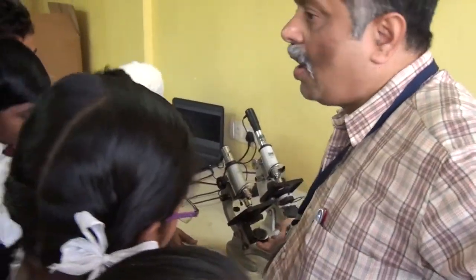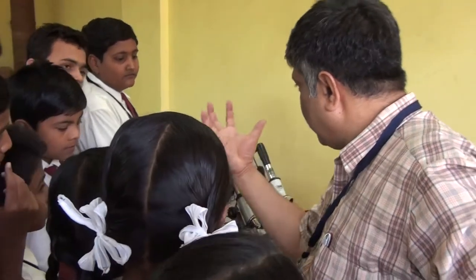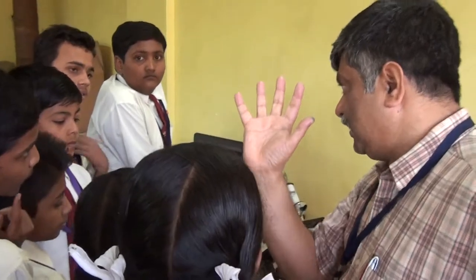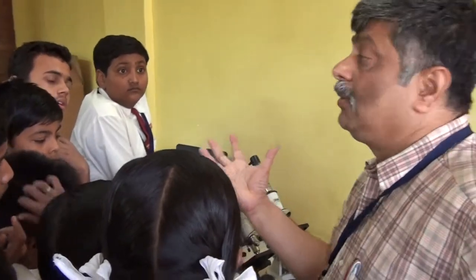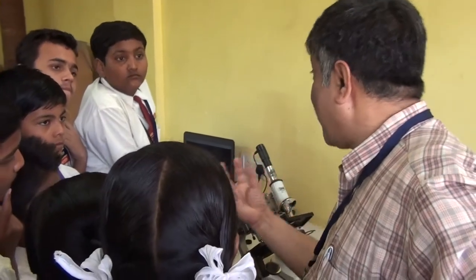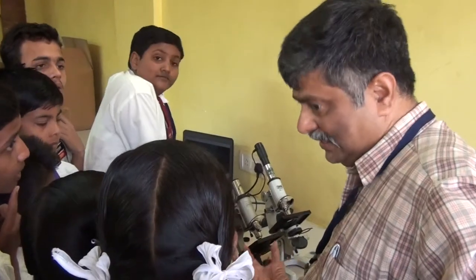Right, this part is a concave mirror. It's a mirror. So if you put a mirror under the sun, what does it do? It reflects light. But if you put a concave mirror, it not only reflects, it also converges the light. So you converge the light, make it bright, and put it on top. This is for converging the light.